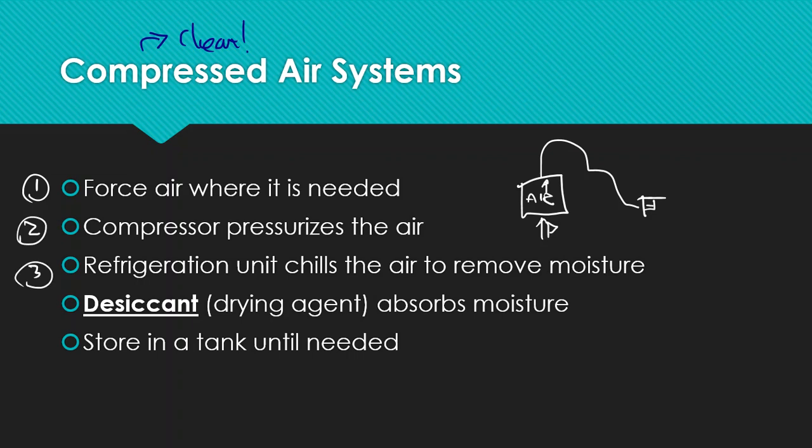Number three, refrigeration will chill the air, and that helps remove any of the impurities, and in this case, moisture mainly, that will happen here. So think of it as you going into a walk-in freezer. Compressed air could be coming from your lungs, let's just pretend, right?